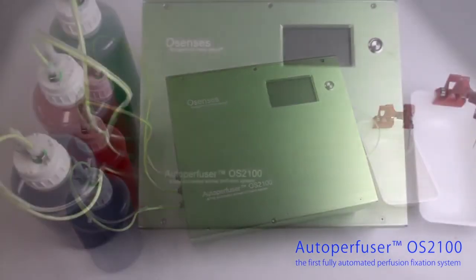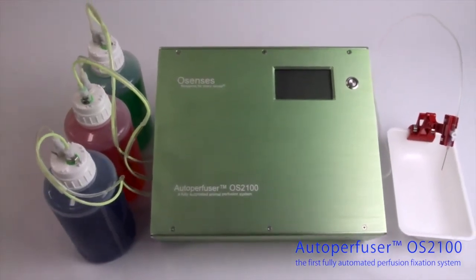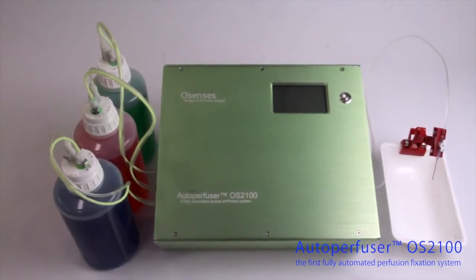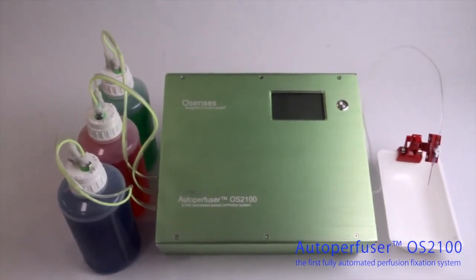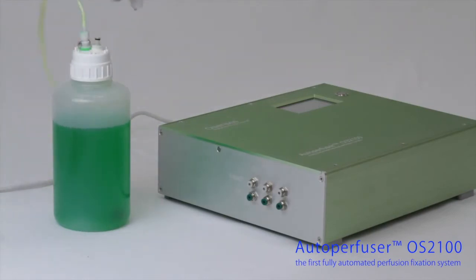The Autoperfuser is the only fully automated animal perfusion fixation system available, and it allows the pressure, volume, and duration of the perfusion to be programmed. The Autoperfuser is equipped with three inlet bottles that can be individually programmed.